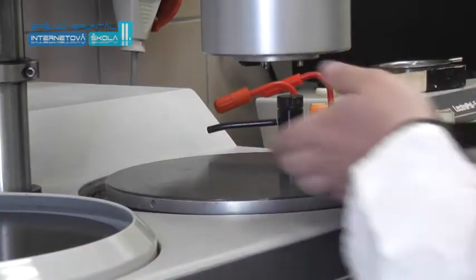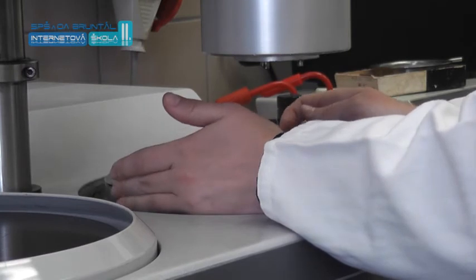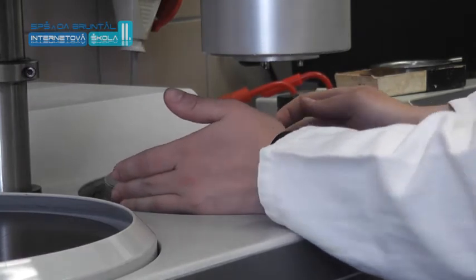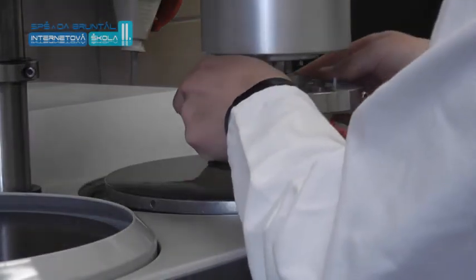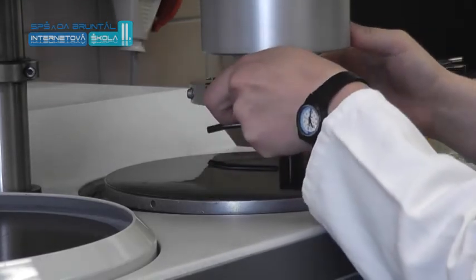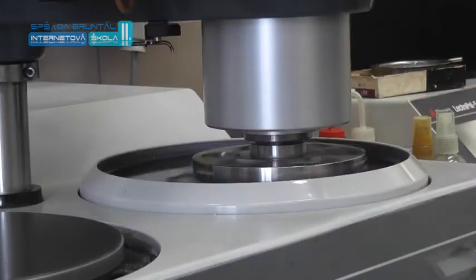Small samples are embedded in blocks using suitable materials - synthetic resins - enabling mechanical processing by grinding, then polishing to high gloss with subsequent etching. Etching makes the structure visible.